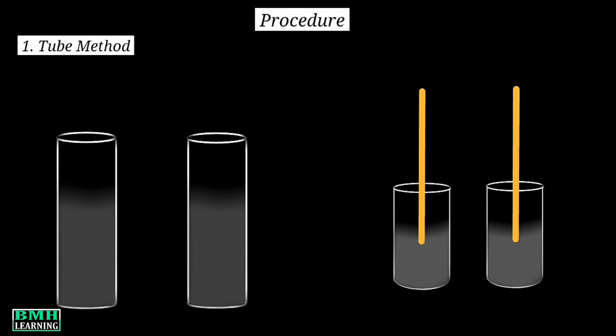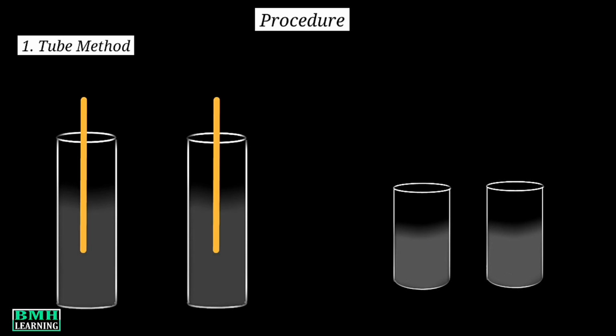We are using two different bacterial species here. Now, immerse the stick having bacterial colonies in separate test tubes containing hydrogen peroxide solution. You can notice in one bacterial species there is immediate bubbling, which shows the bacterial sample is possessing catalase enzyme. In the second case, no bubbling is observed, which demonstrates the bacterial species does not have catalase.